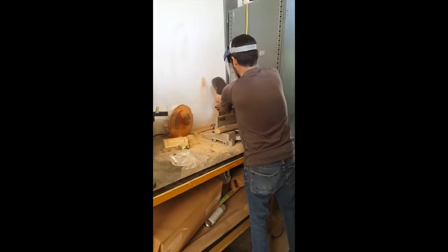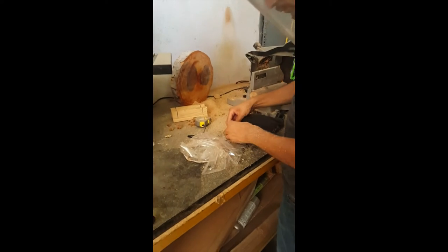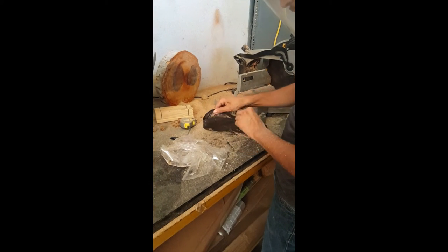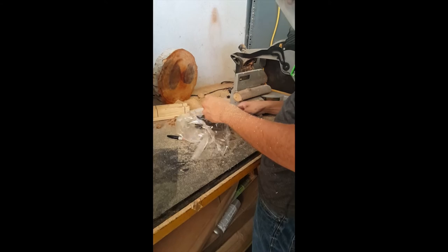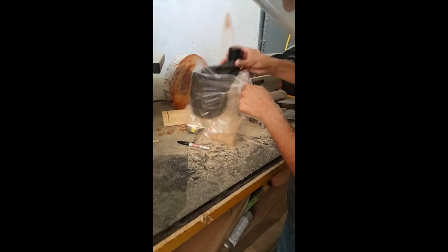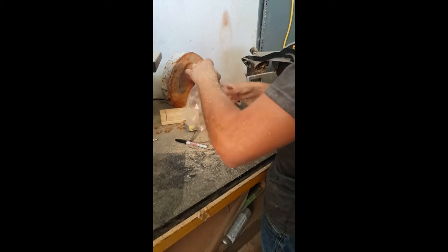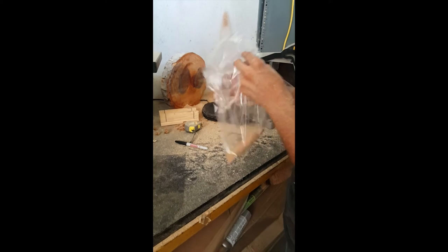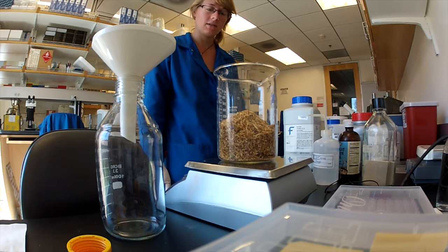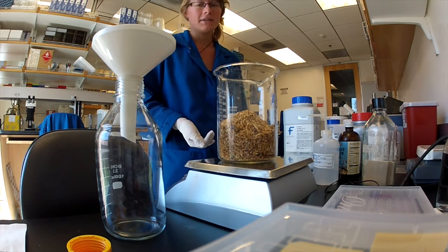You may need to adjust the amount of sawdust in your diet recipe depending on the sawdust consistency. I'm going to be showing you a demo of how to make the Polyphagous shot hole borer rearing diet. It's a very simple procedure.